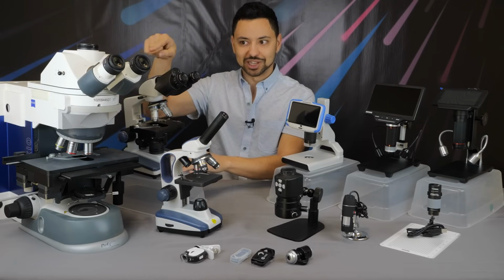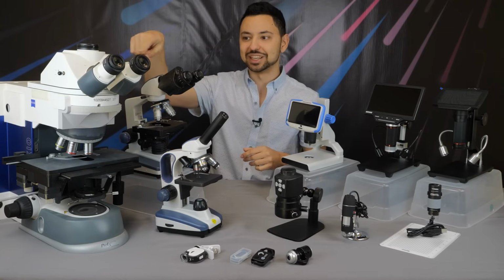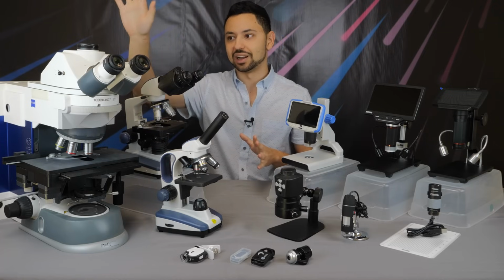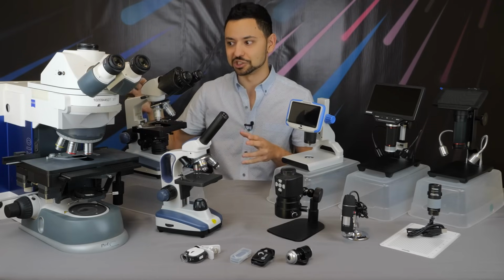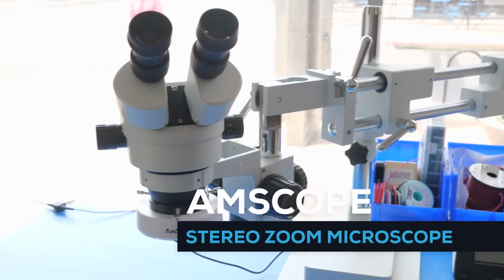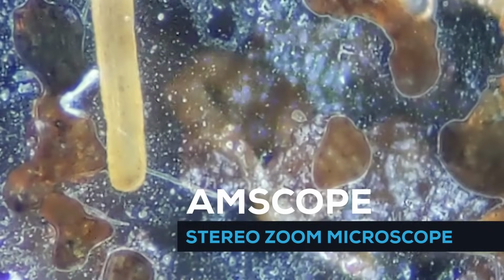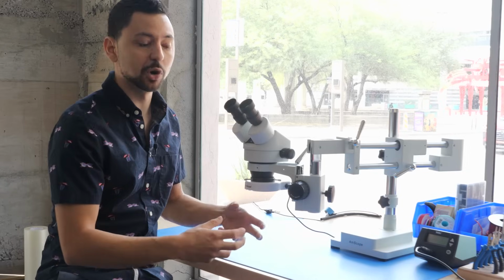The only reason that I'm able to have this microscope is because I found it in a dusty basement and I got it super cheap, medical surplus. But I will talk more about this at the end of the video because it has a lot of really interesting features to it. This is a stereo microscope, a relatively low magnification microscope, which is typically good for things such as soldering, jewelry making, biological dissections, electronics inspection, anything that you have to physically manipulate under the microscope and you need good magnification to actually see what you're doing.